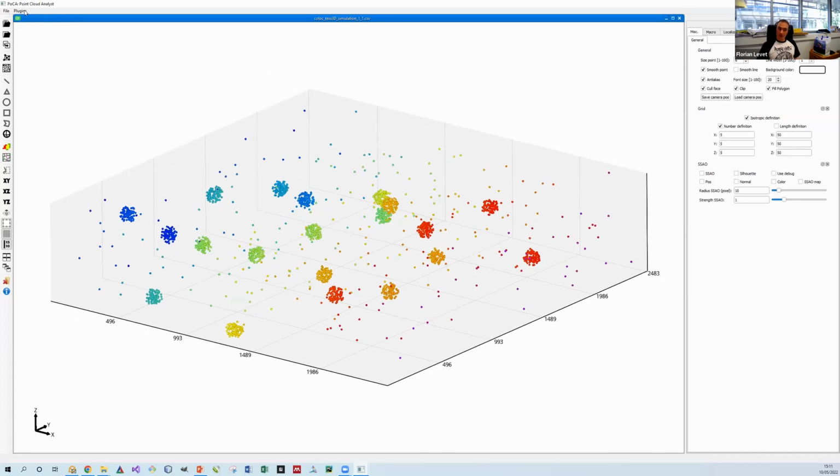You can create some Voronoï in 3D. So here you have some options for the plugin. You can go to the parameters. In this case, I will say that I want to create the cells, which is not mandatory. In the Voronoi diagram, some cells are created, but they are not passed along to the CPU. That means that when you want to create cells, it will be done after the creation of the Voronoi diagram on the CPU. And this is something that takes quite some time for bigger data sets.